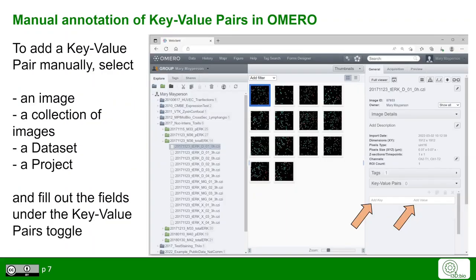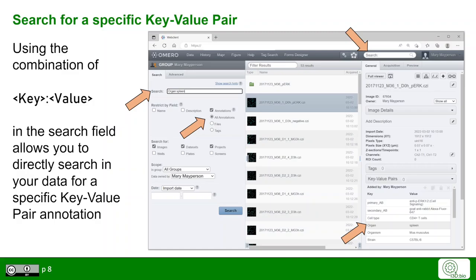To add a key-value pair manually, select the image, images, dataset, or project, then go to the General tab and fill out the keys manually in the key-value pairs toggle. Once entered, you can use the key-value pairs in the search function. Just use the key, separate it from the value with a colon in the search field, and make sure you have selected all annotations under the restriction for fields.